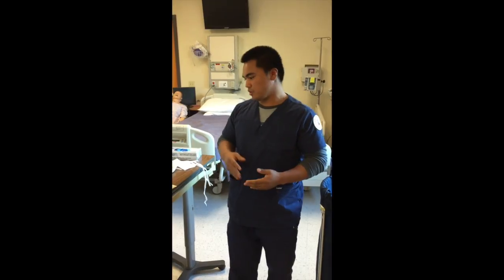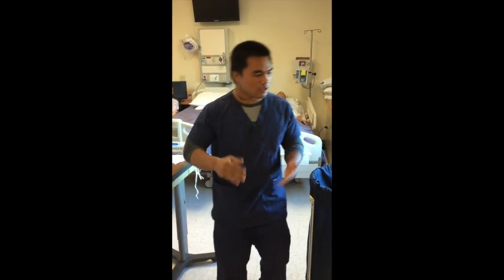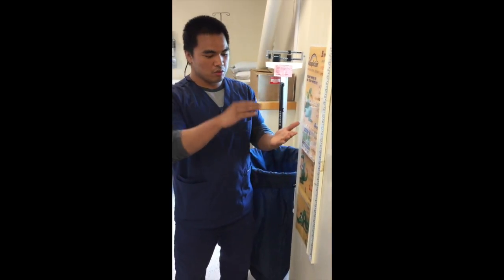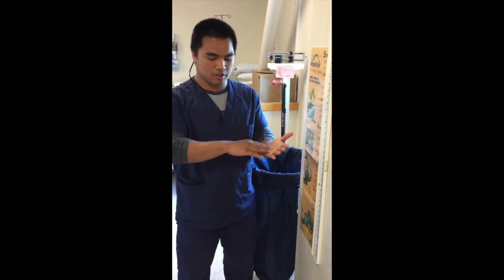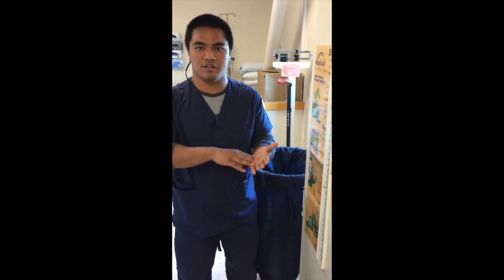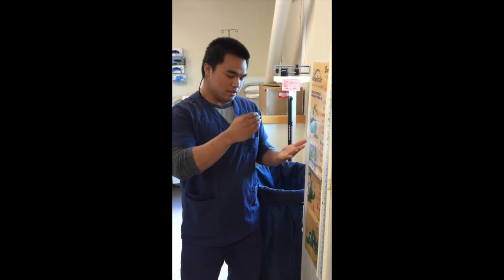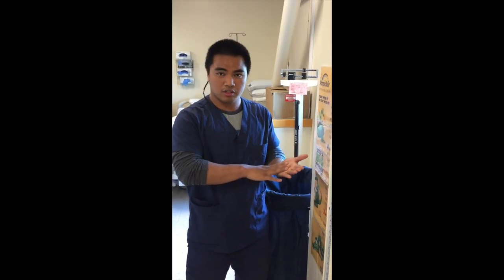So now I'm going to show you how to do a transmission-based precaution, which is going to be airborne. But before I do that, I will check the patient's chart. The patient's chart will tell me what kind of precaution they are under and what kind of equipment I will be putting on. On this chart, it says that the patient has an airborne precaution.